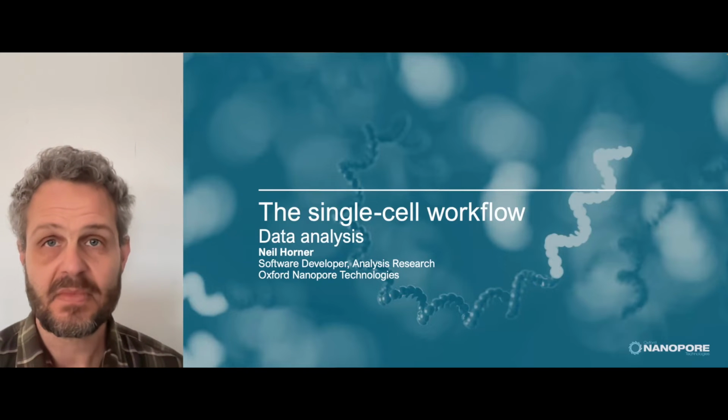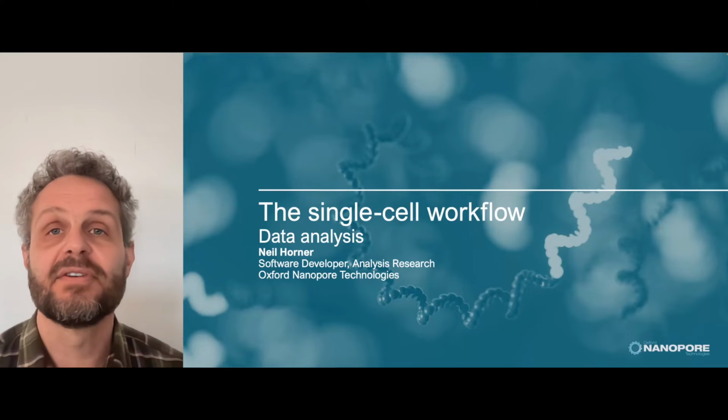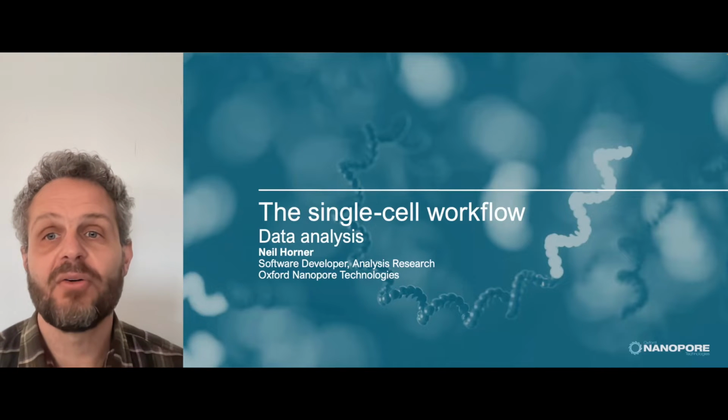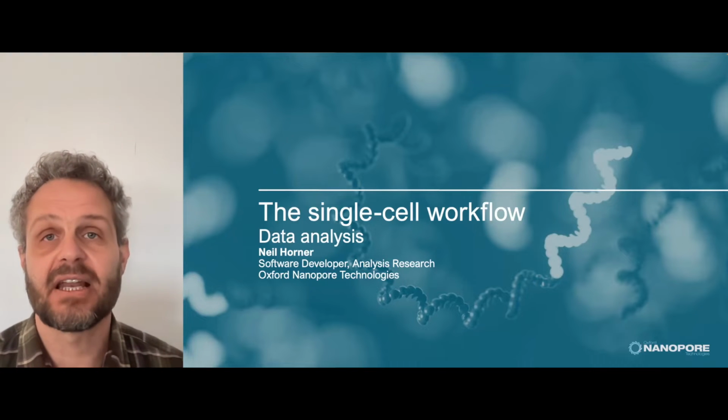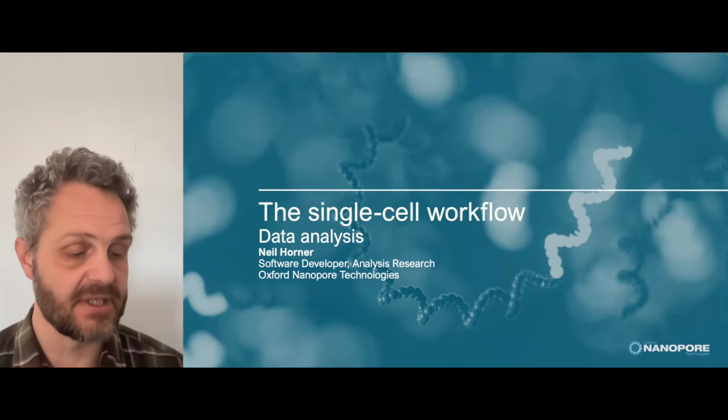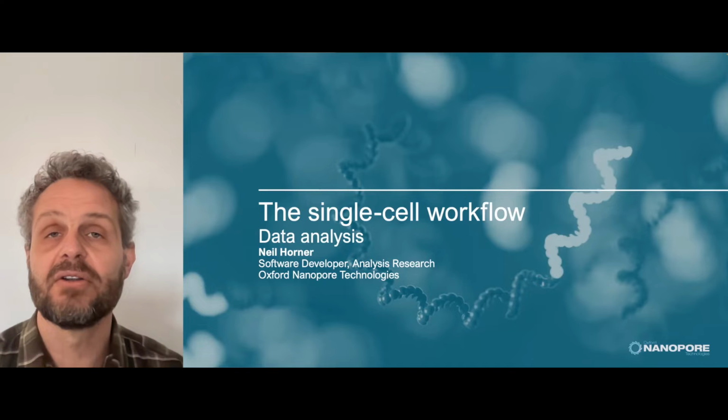So thanks to Rebecca for talking about the wet lab side of things. I'm involved in the development of the data analysis workflow for analysing Oxford Nanopore single cell sequencing data and the workflow wf-single-cell.